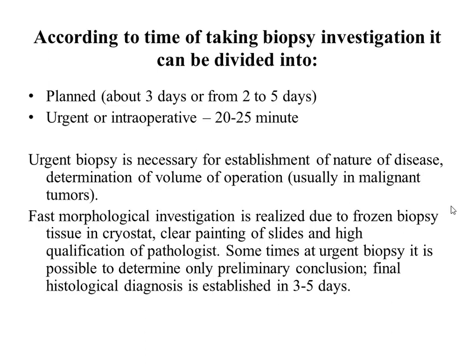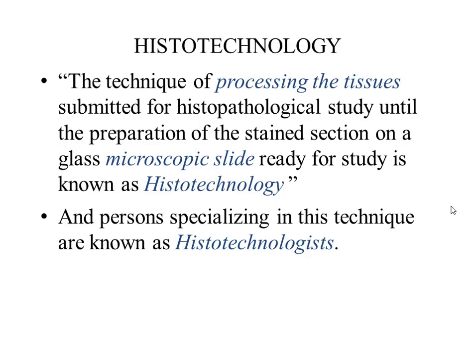Fast morphological investigation is realized due to frozen biopsy, tissue in cryostat, clear staining of slides, and high qualification of pathologists. Sometimes at urgent biopsy it is possible to determine only a preliminary conclusion. Final pathological diagnosis is established on the 3rd to 5th day.